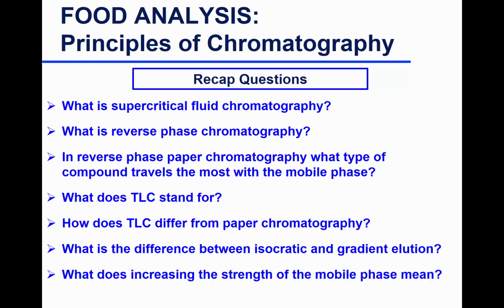Very good, excellent. You gave pretty good examples, but what we mean by increasing the strength is making the mobile phase stronger in the sense that the solute wants to interact with it more than the stationary phase. Okay, so that the solute leaves your stationary phase and doesn't stay connected or interacting, because you don't want your solute to stay on the column or on the stationary phase.